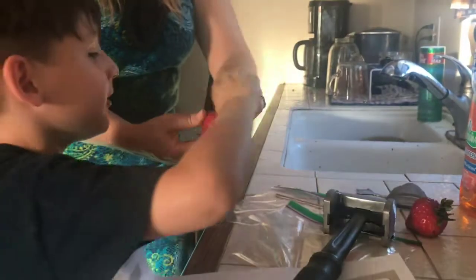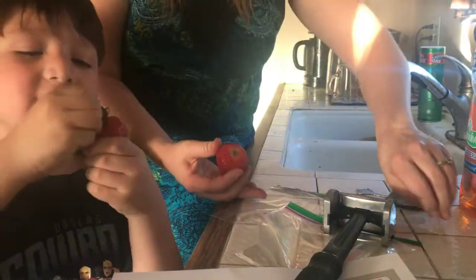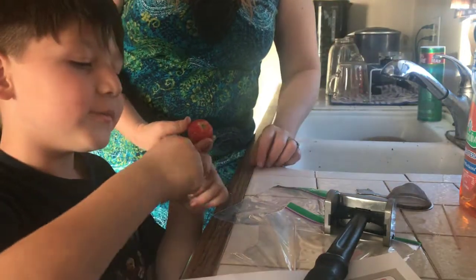Let's do our first step — we've got to take the green off. So take it off your strawberry. Kids, you've got to take off the seeds from the strawberry.